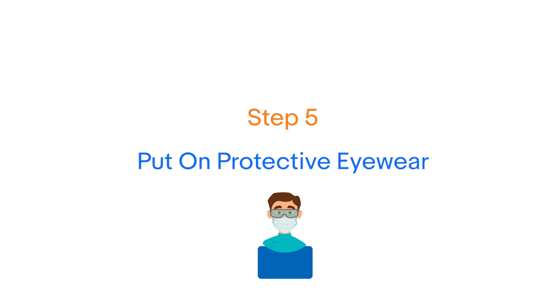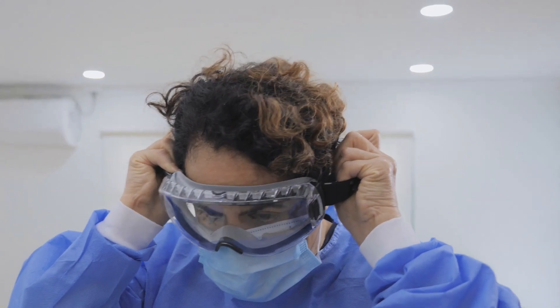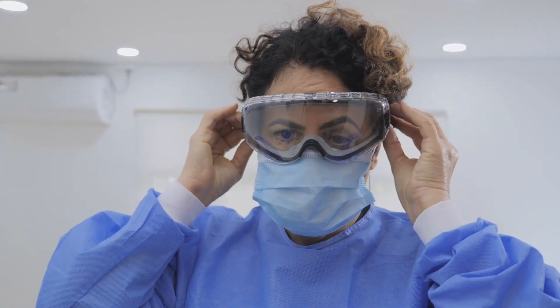Step 5: Next is the protective eyewear. You can either wear an eye goggle or a face shield. If wearing a goggle, it should sit on the top part of the mask.